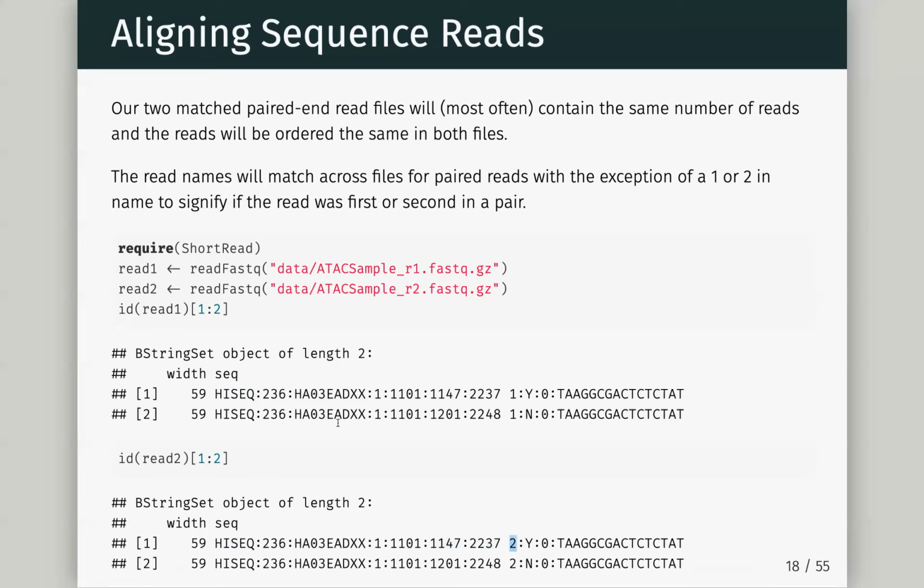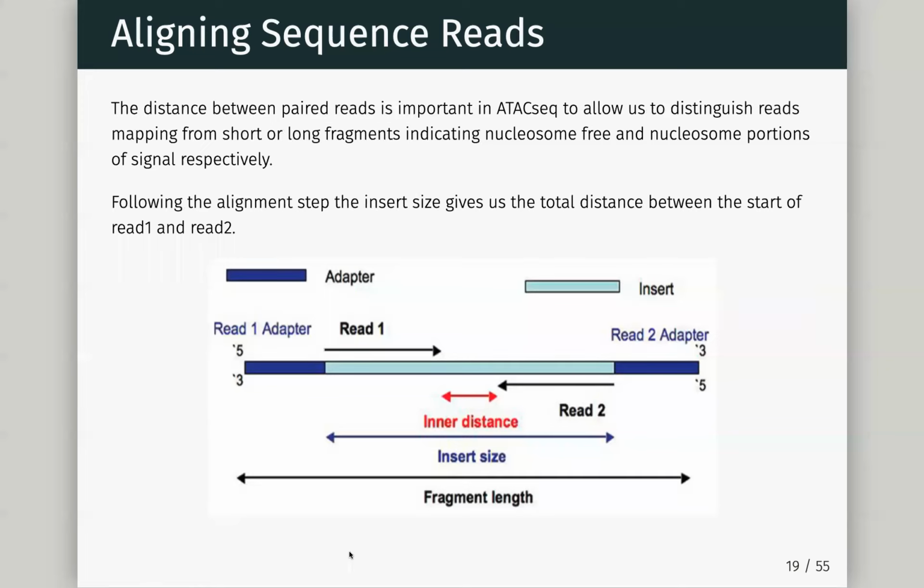These reads come from the same fragment, and they're actually reading from either end of the fragment. We can look at that here. This is the actual fragment we're reading. There's a little bit of confusion when you go to your genome center, because you're going to have differences between fragment sizes. Remember, when you go to your genome center and you get that final size of your fragment, that often includes the Illumina adapters on the ends of your fragments, and they are just required for sequencing. That's where we start sequencing from. But it's this insert, this fragment, which is our target sequence.